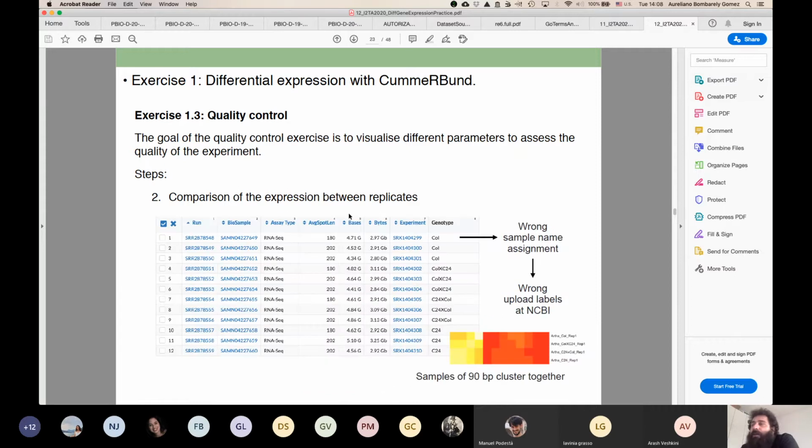So the thing that I did was I went again to the NCBI, and then I went sample by sample. I took this run name. I'm looking at the equivalence that I have for the names that I changed later. And also, if you look into your sample, so you open your FASTQ files, you will see a sequence ID. So the sequence ID that you see is this one, the name of the run. So I was checking everything, and everything looks the same.